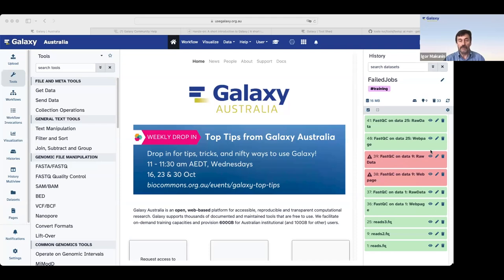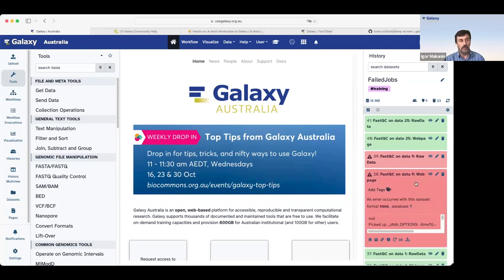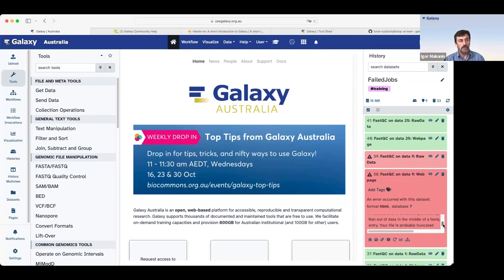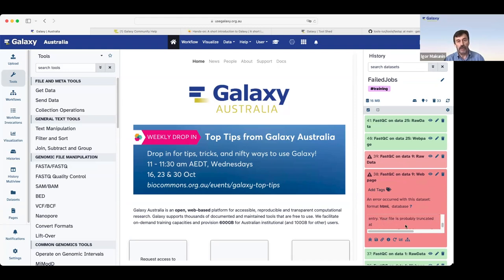If we click on output of a failed job, we see a tiny bit of a preview here with the scroll down menu. And if we pull it down, we'll see a message. In this case, your file is probably truncated. So this is one place to find information.